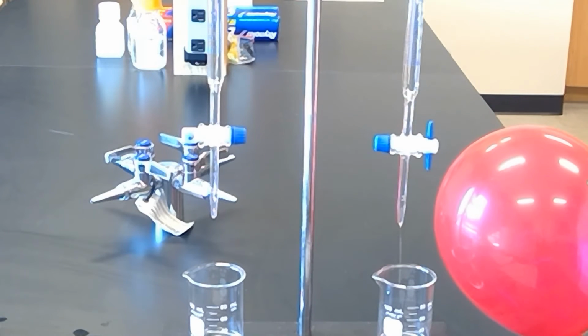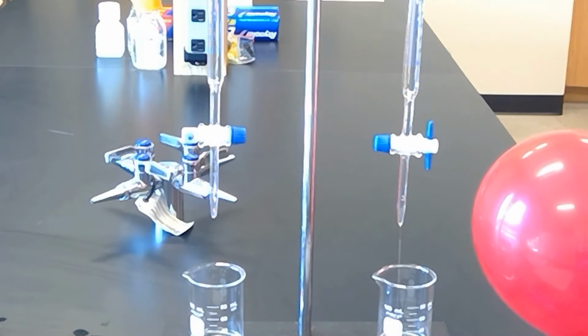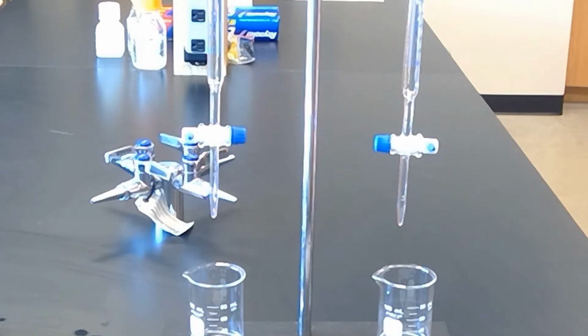And this really doesn't have any effect. My stream stays pretty normal for the most part. So no effect for the balloon. What you fill in your data table is for water, it attracts to the balloon, acetic acid attracts, isopropyl alcohol attracts, hexane has no reaction.